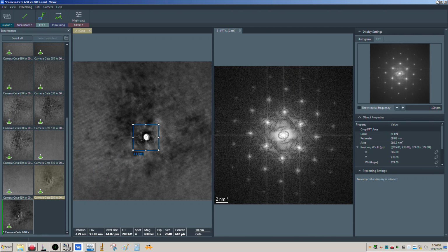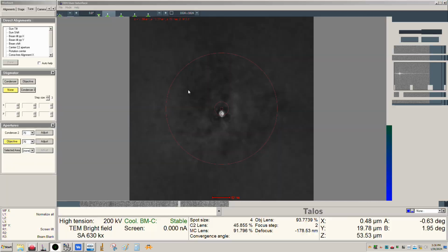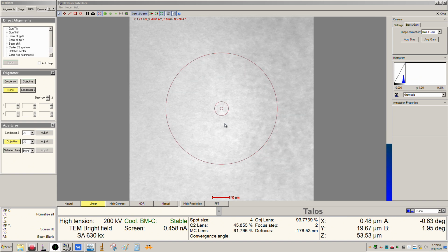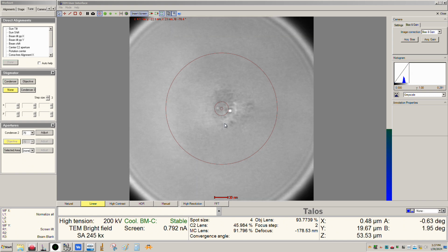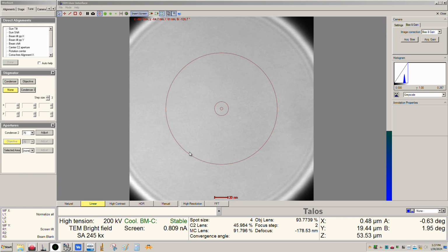So okay, I think that about covers what I wanted to go over here as far as the PSA on beam damage. You can see here, right, because of the contrast, it got dark everywhere. If I move off of the hole, yeah, see there, it kind of evens out. So yes, we succeeded. I believe we did anyway, of burning straight through the sample. And if you look around too, you can see just in the vicinity here, there's the effect of that irradiation, not just in the ground zero, so to speak.